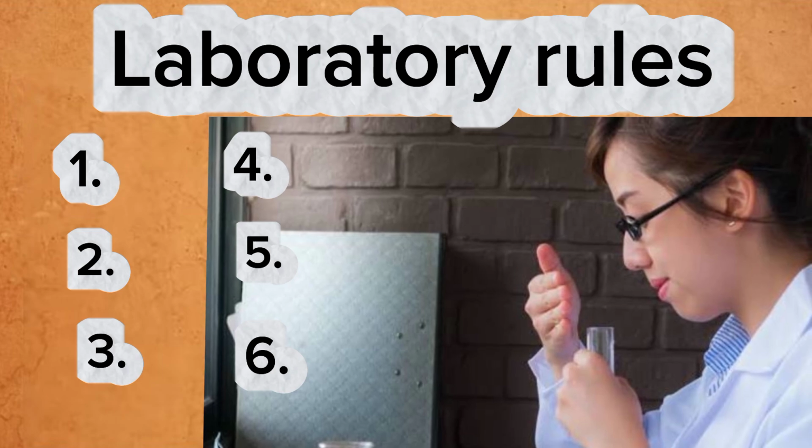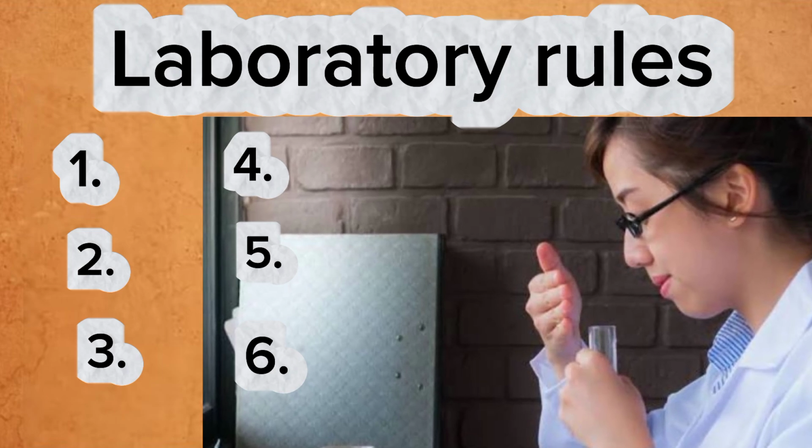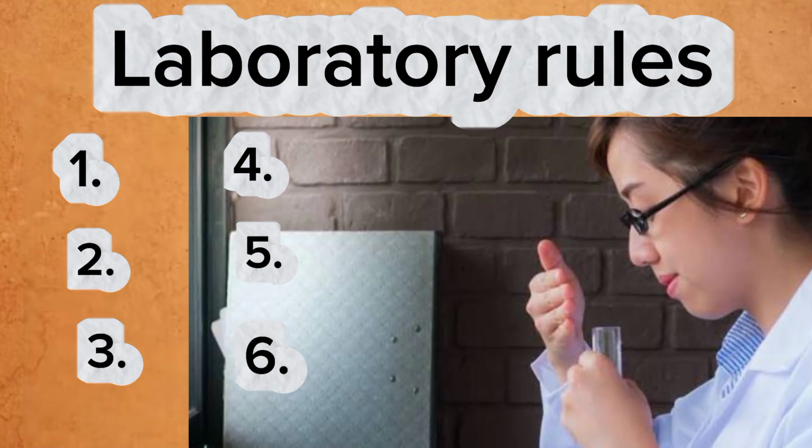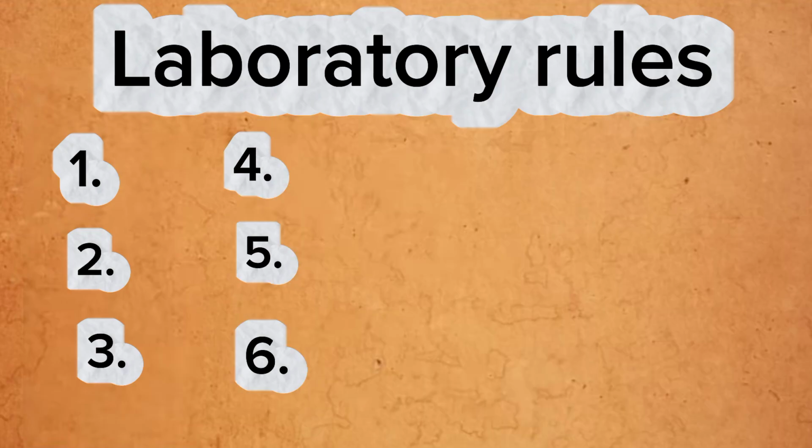Waft, using your hands. But you don't smell directly, because some gases are irritating. Dispose of the laboratory waste properly. Then number 8, always inform the teacher or technician when an accident happens. In the case of an accident, inform the teacher available in the laboratory or the lab technician.